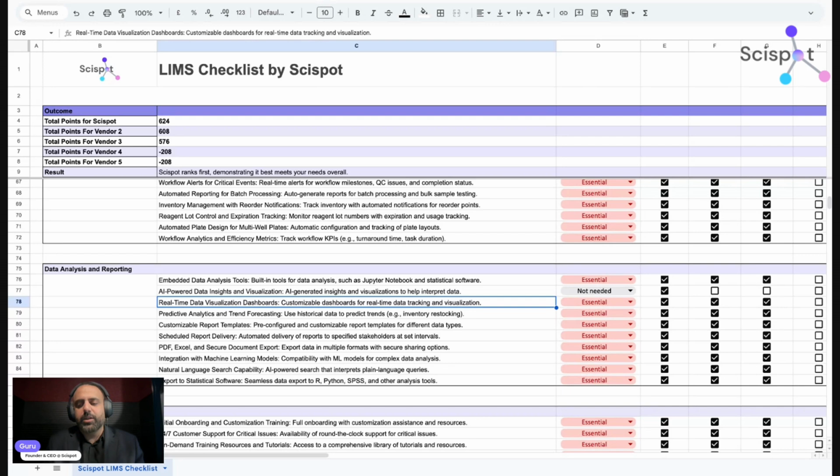If your LIMS is not configurable enough, and for every small thing you have to contact your vendor, it's probably not a fit, because in many cases the LIMS vendor will also charge you for custom work. So you want to make sure it's out of the box, so they are not writing thousands of lines of code and charging for that too because the system is rigid. They have to build these custom features, and it's very expensive and a bad experience.